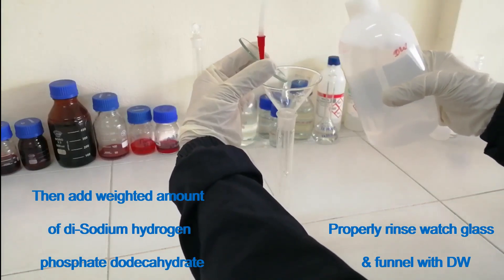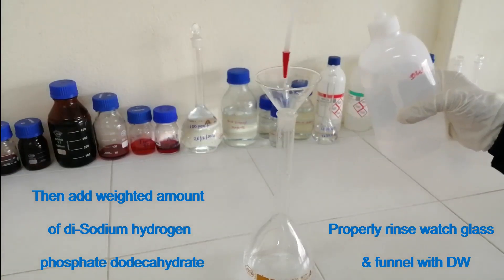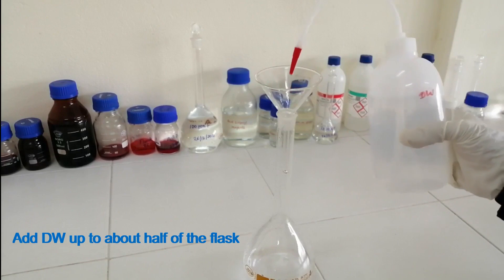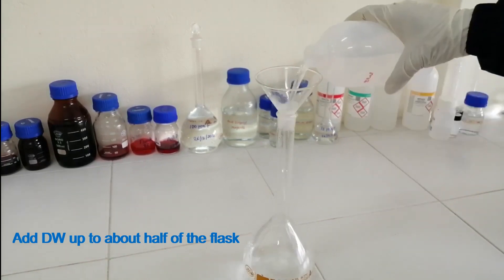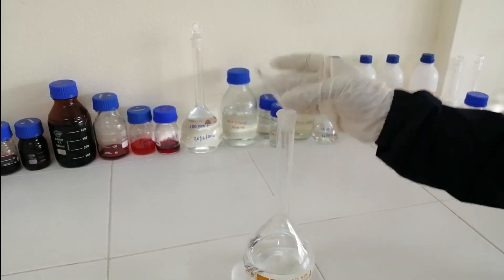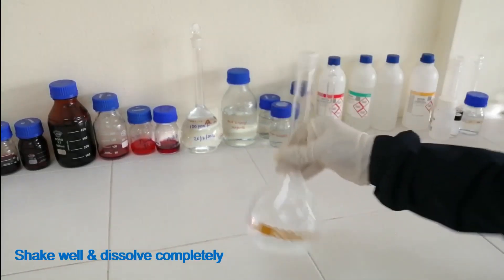Properly rinse the wash glass and funnel with distilled water. Add distilled water up to about half of the flask. Shake well and dissolve completely.